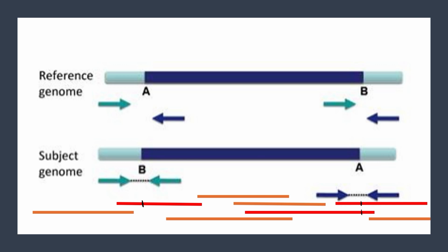These are visually obvious in IGV, and they indicate the genomic positions of the breakpoints for the structural variant, in this case, the inversion. These poorly aligned insert ends are automatically hidden by IGV. This is because IGV automatically hides what it calls soft-clipped bases. It does this because many sequencing chemistries produce poor quality insert ends. Ignoring these error-filled ends generally creates better alignments, and that was fine when we were looking for small mutations because it removed some of the noise that obscured them.